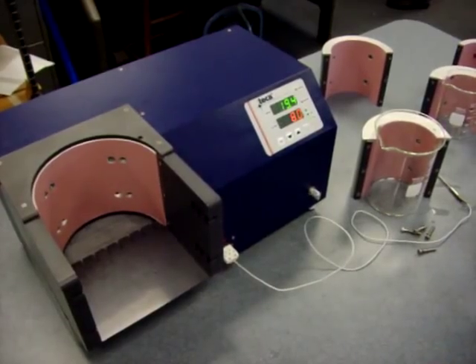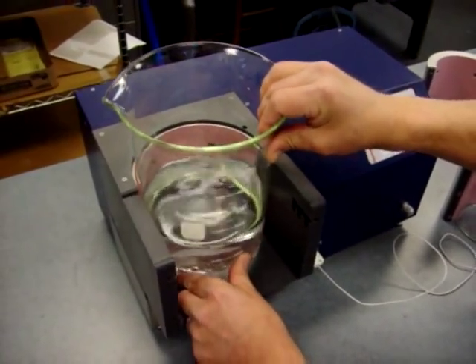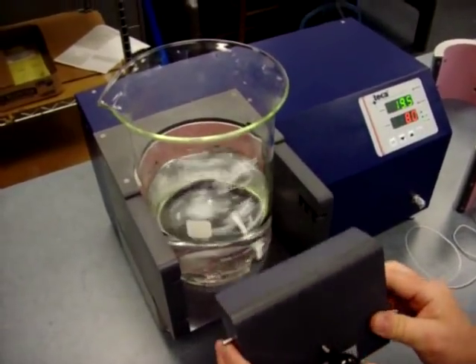What I'm going to do is take our large beaker here and put it in place. How large of a beaker is that? That's a three and a half liter beaker.